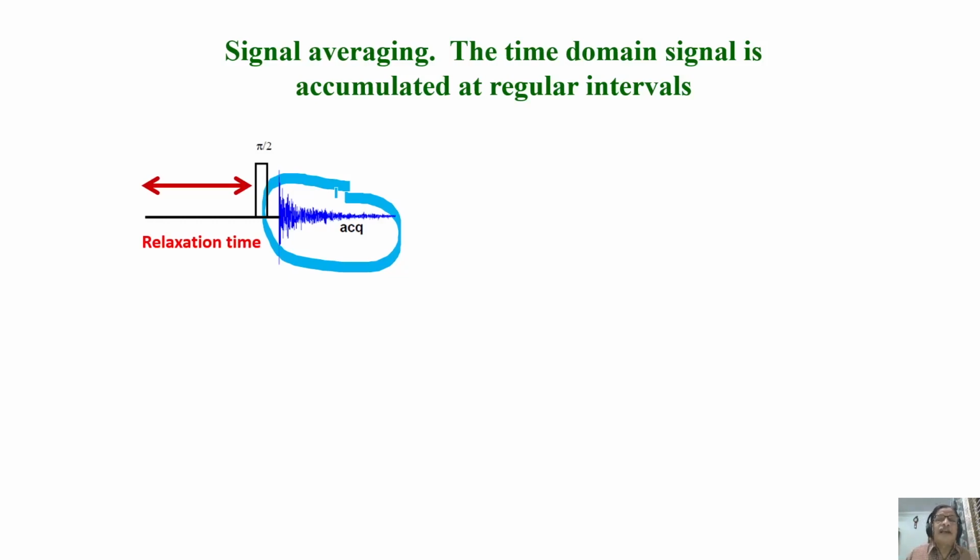What happens if you take less abundant spins? For example, you want to see nitrogen in natural abundance. You cannot get the signal in one scan or one accumulation. Okay? So we are acquiring data once, we call it scanning once. So it is one scan. So you keep on adding, you have to increase the number of scans.